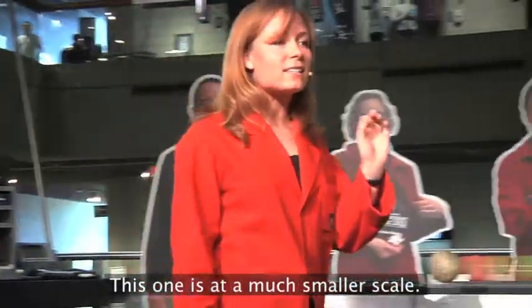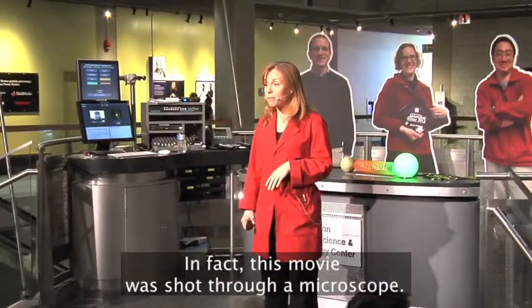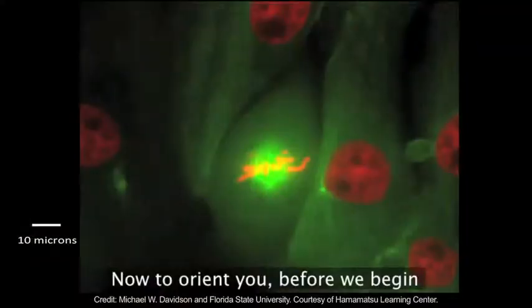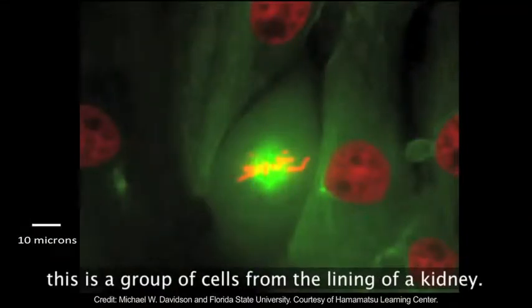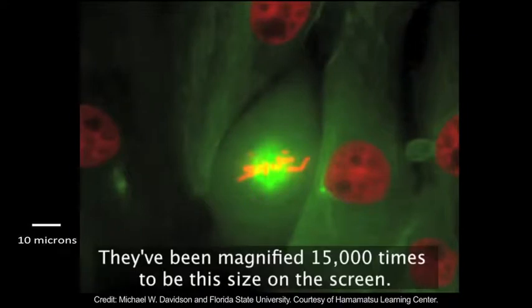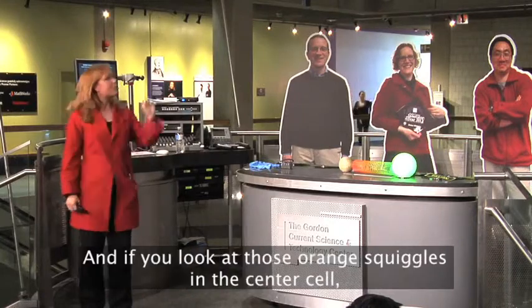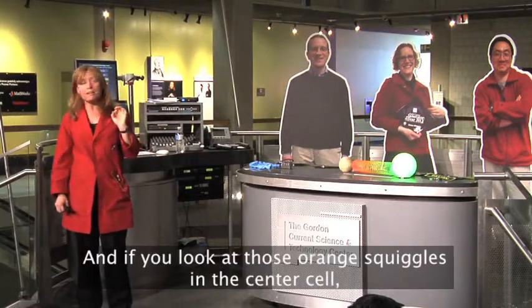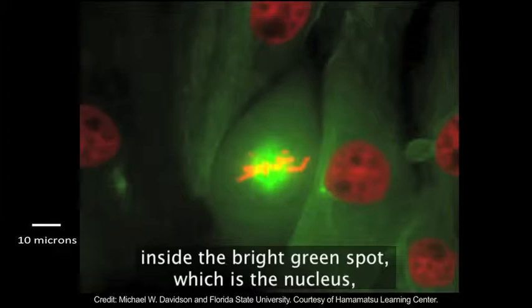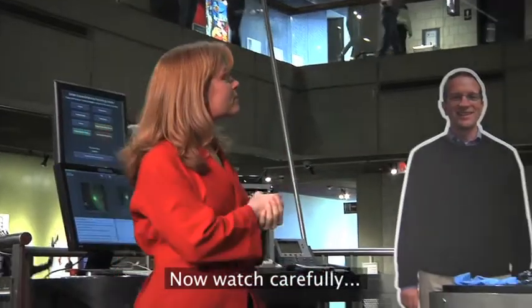Now, this one is at a much smaller scale. In fact, this movie was shot through a microscope. Now, to orient you before we begin, this is a group of cells from the lining of a kidney. Each cell is about 20 microns in size. They've been magnified 15,000 times to be this size on the screen. The cell bodies have been stained green and the nuclei have been stained red. And if you look at those orange squiggles in the center cell, inside the bright green spot, which is the nucleus, those are the chromosomes of that cell's nucleus. Now watch carefully.